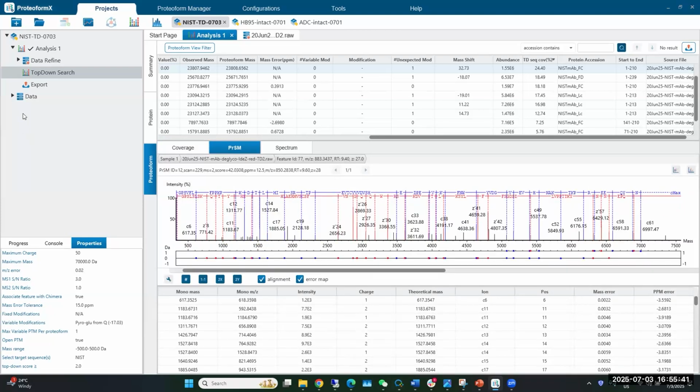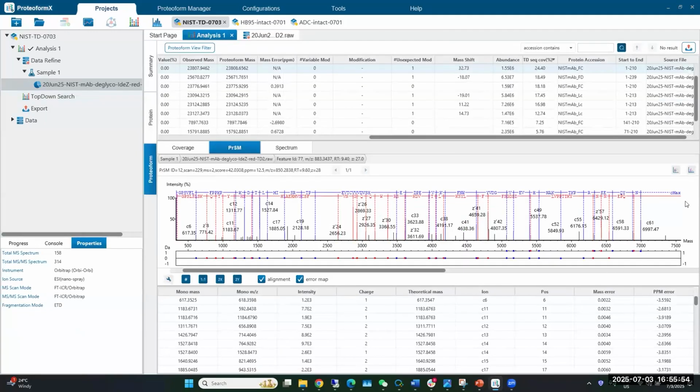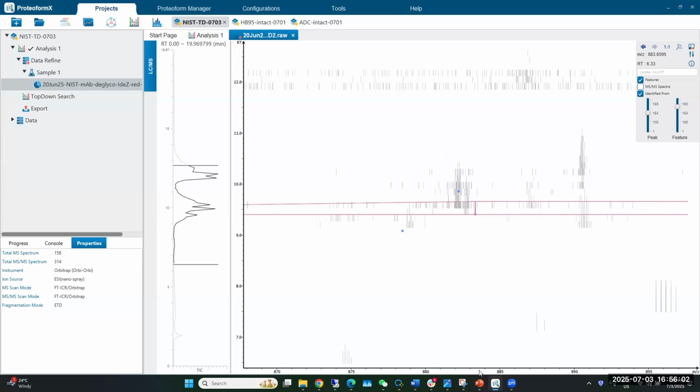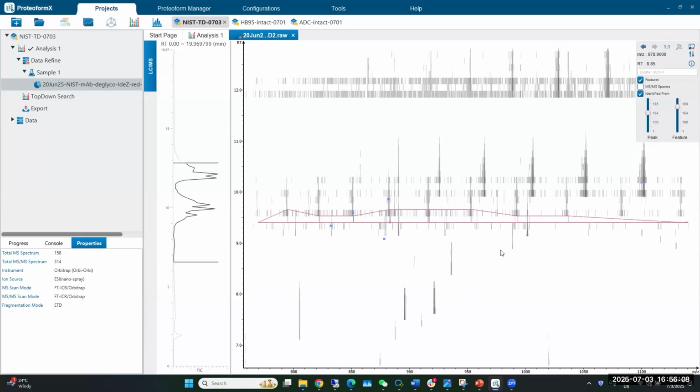And if I also show you the data, we have a data view here. Now if you go here, you have a jump, and then we can jump to the LCMS view. And this one has a good point. You can see those are feature groups which belong to this form.